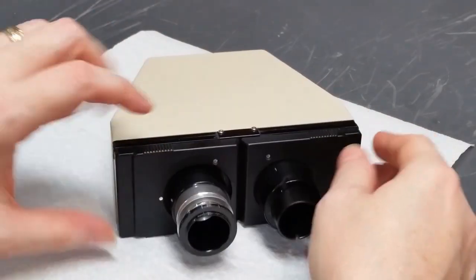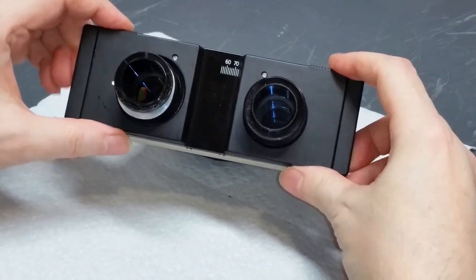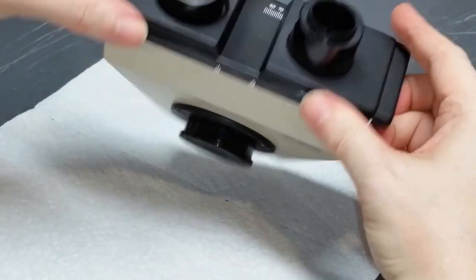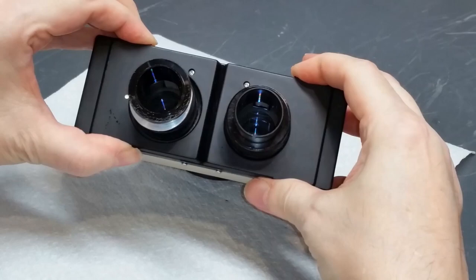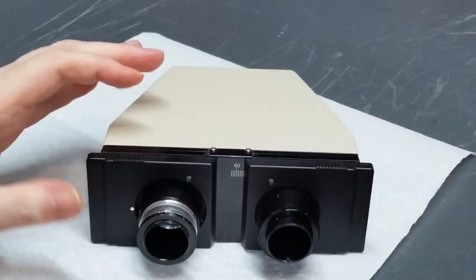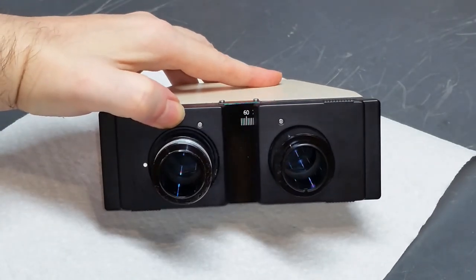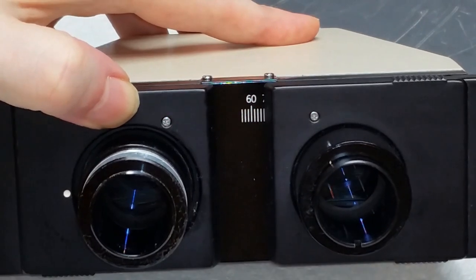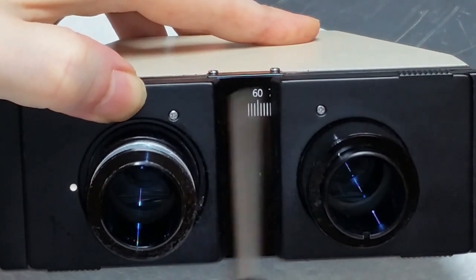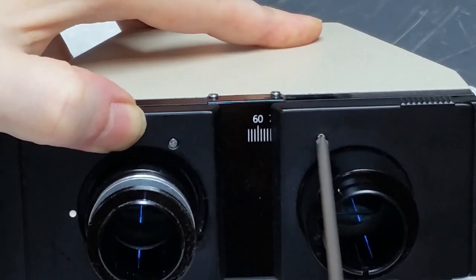The next thing I want to do is remove these two plastic grip plates. These have little serrations so your fingers can grip them and adjust the interocular distance. To take those out, there are a couple of small JIS screws — one on the front of each plate. I'm using a JIS screwdriver for this. Let's just take those out.